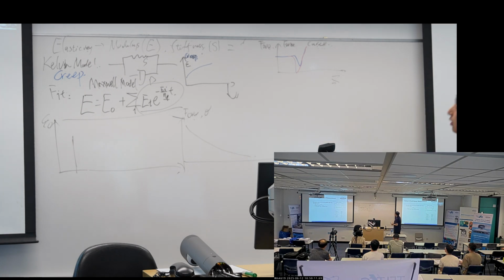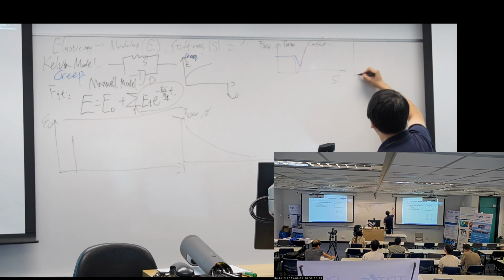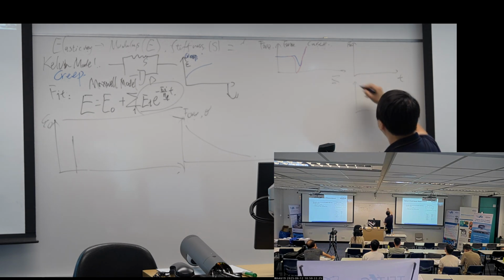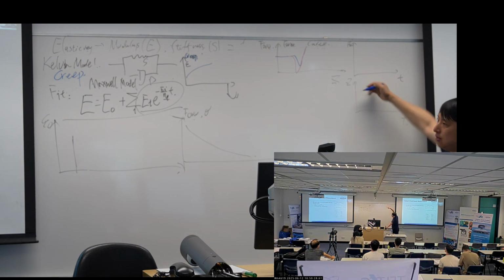Okay, and if we separate into the force against the time and the z against the time, it's simple. The z against time is I'm pushing down and I'm dragging up.